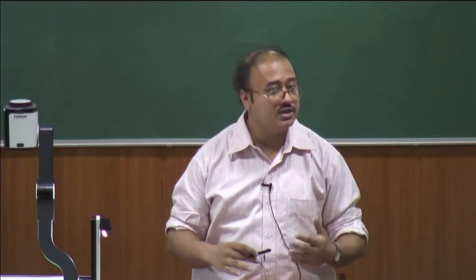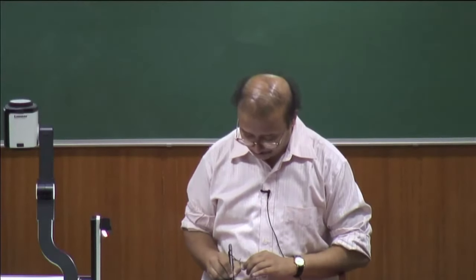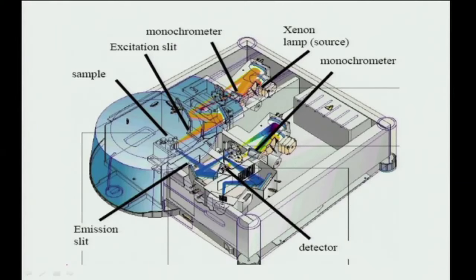manufacturing these things, and then you put them together in terms of a fluorometer, and here this is a fluorimeter that people typically use. So, you can see you have taken the top of a fluorimeter, right. This is no longer a block diagram, right. This is a fluorimeter for you. Okay. Now, see what happens.